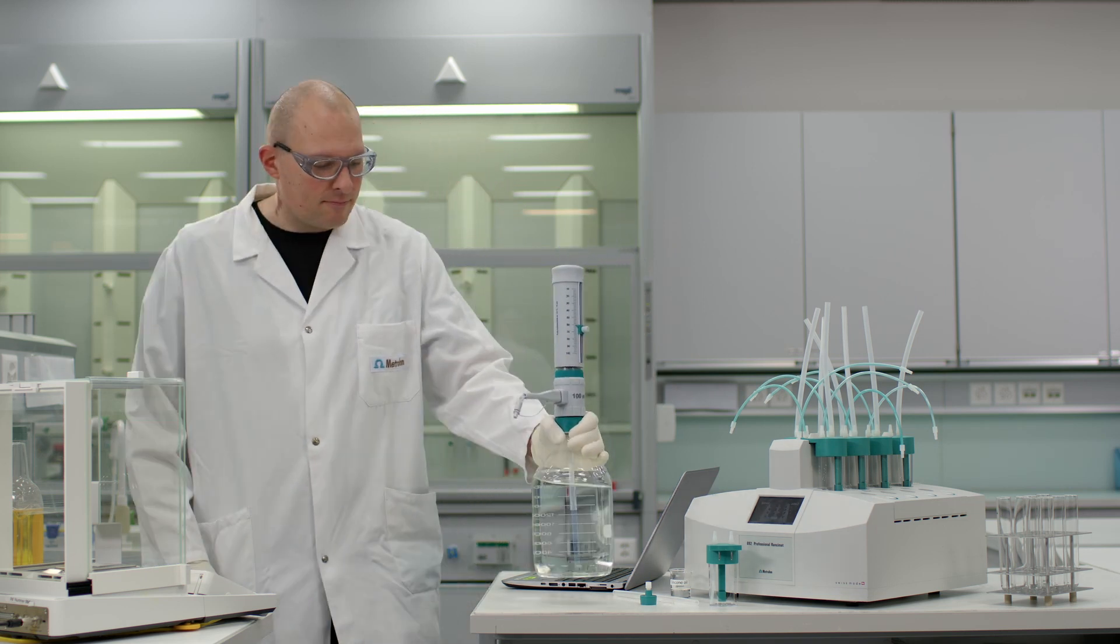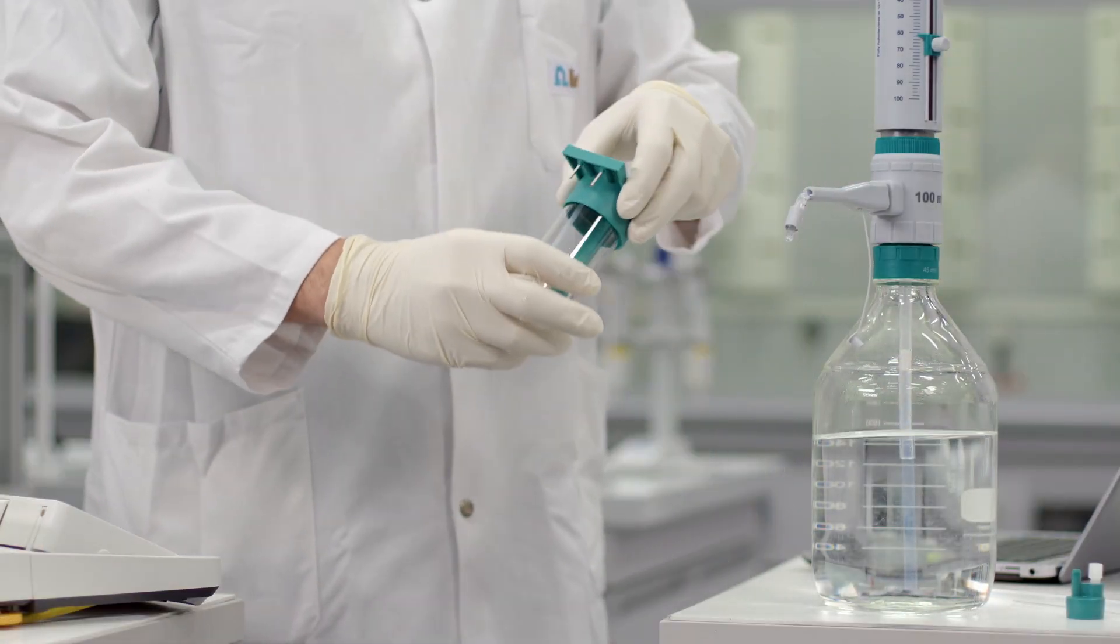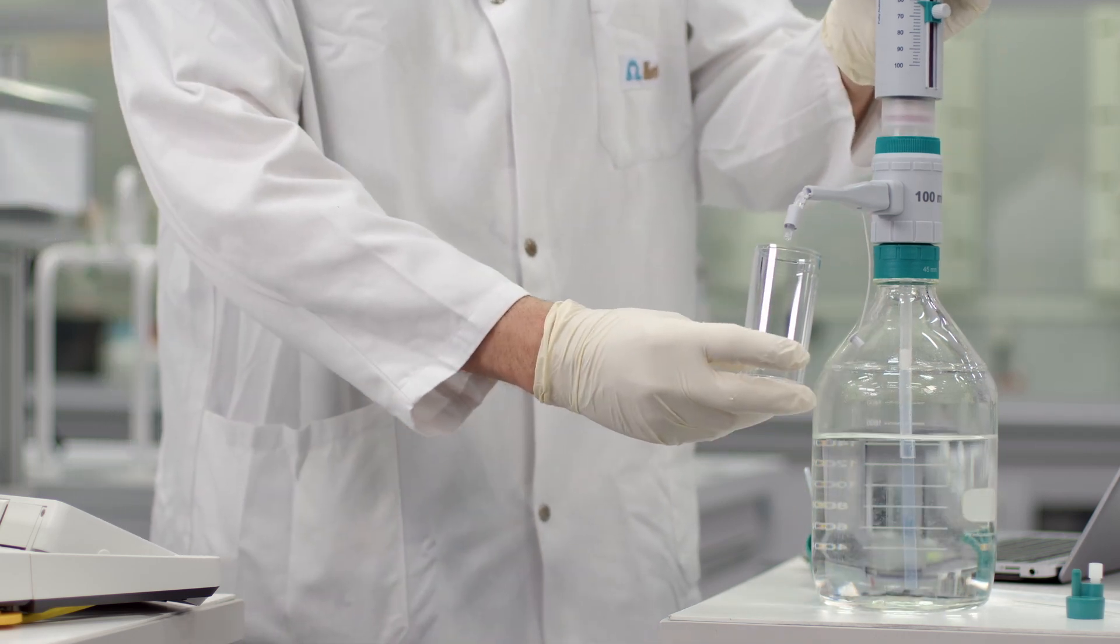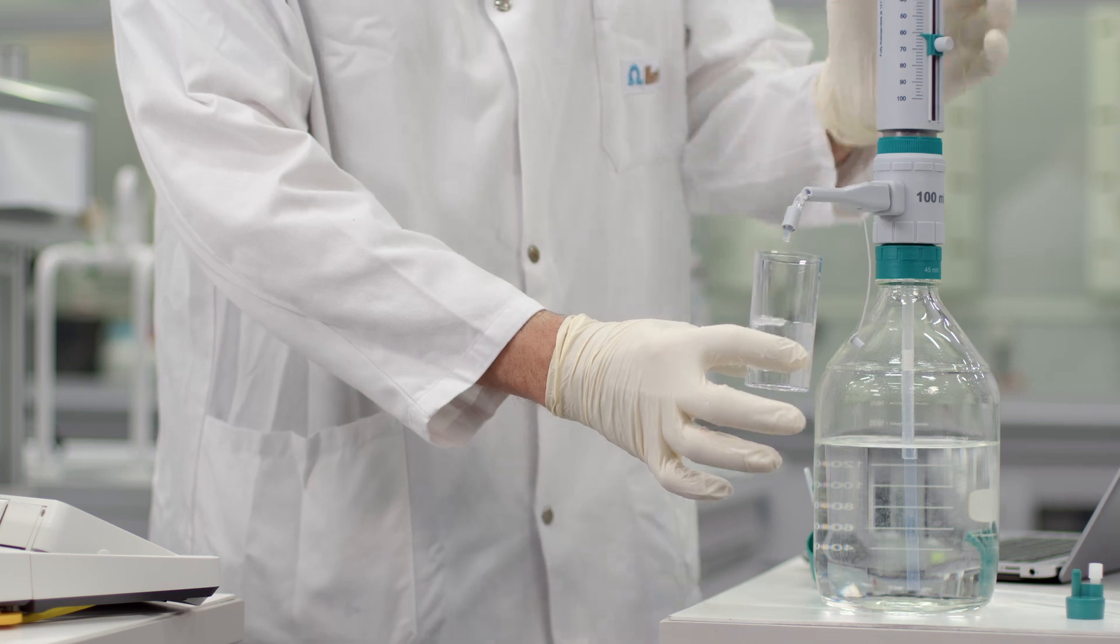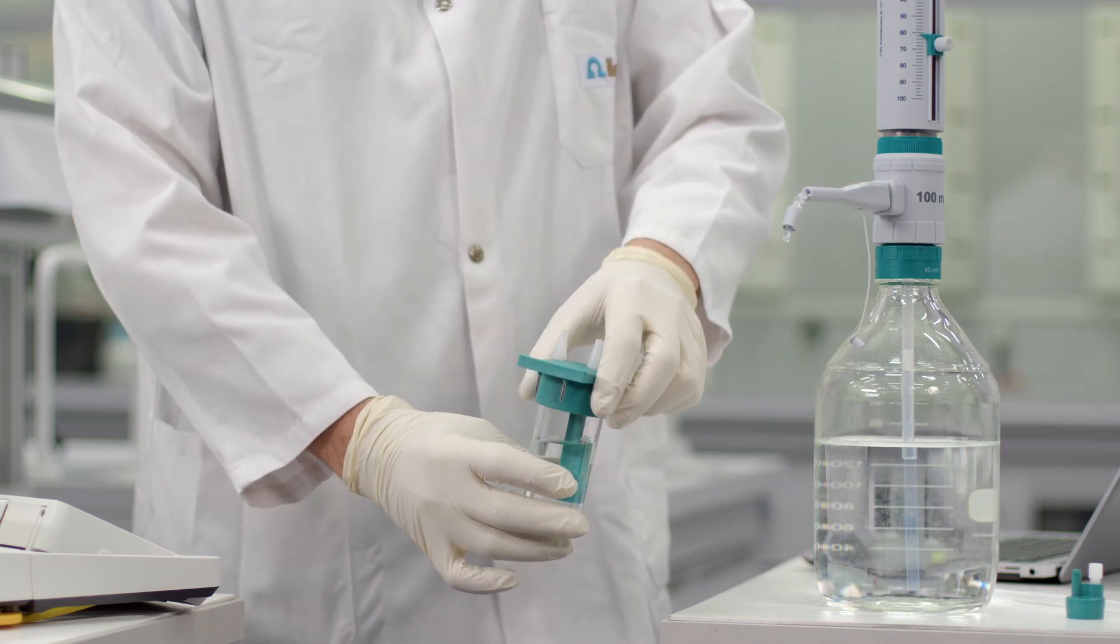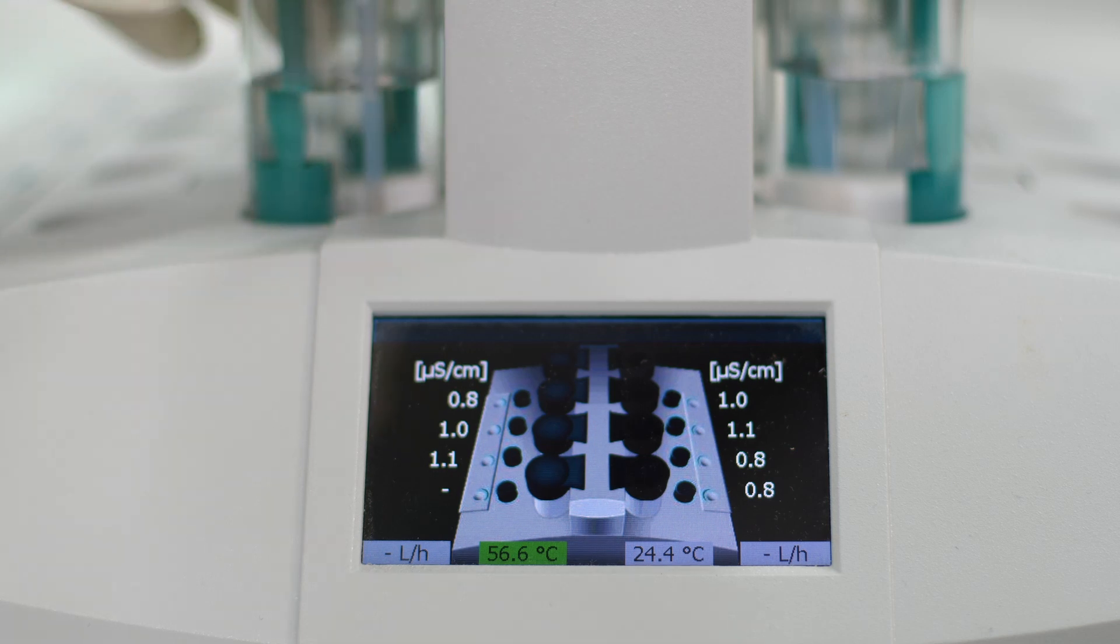Now fill the measuring vessel with 60 ml of distilled water and close it with the measuring vessel cover. Place the measuring vessel onto the instrument. The conductivity is immediately displayed on the front panel. Now everything is ready to start the measurement.